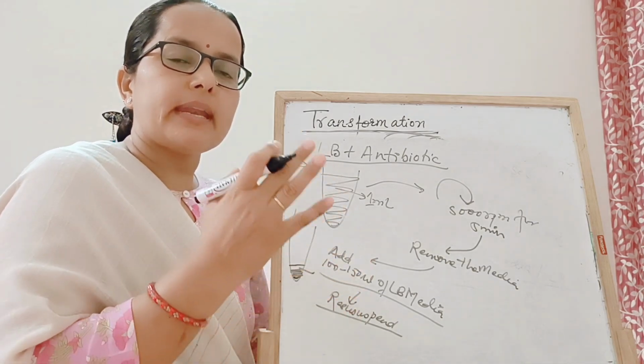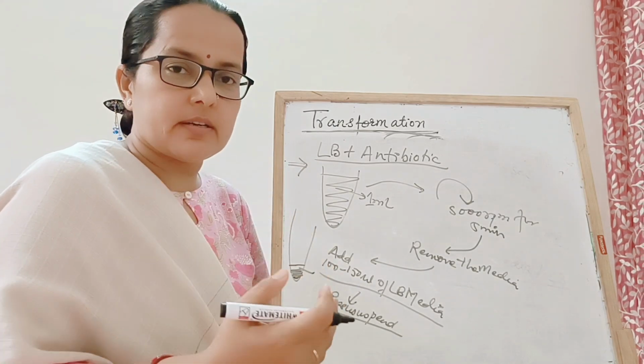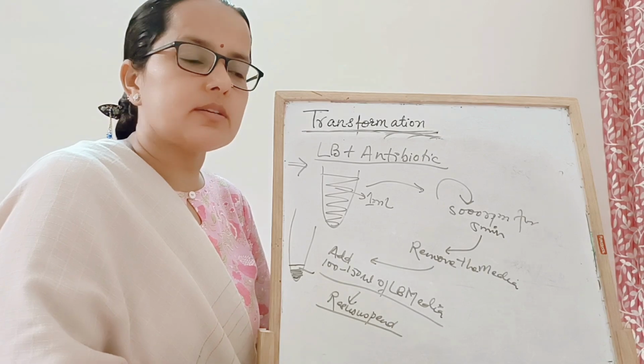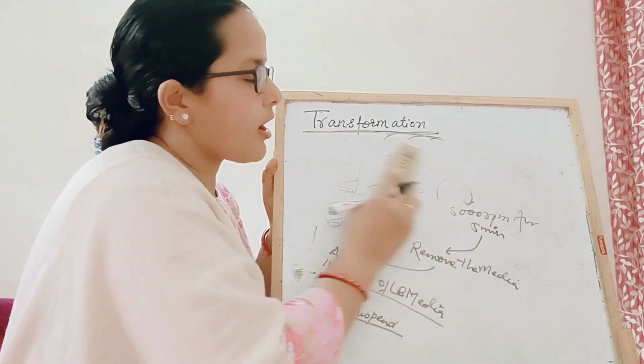So to avoid any contamination among the plates, you should sterilize your glass spreaders. You can work with either ready to use spreaders or glass spreaders. That type of spreading you have to learn and you have to do.